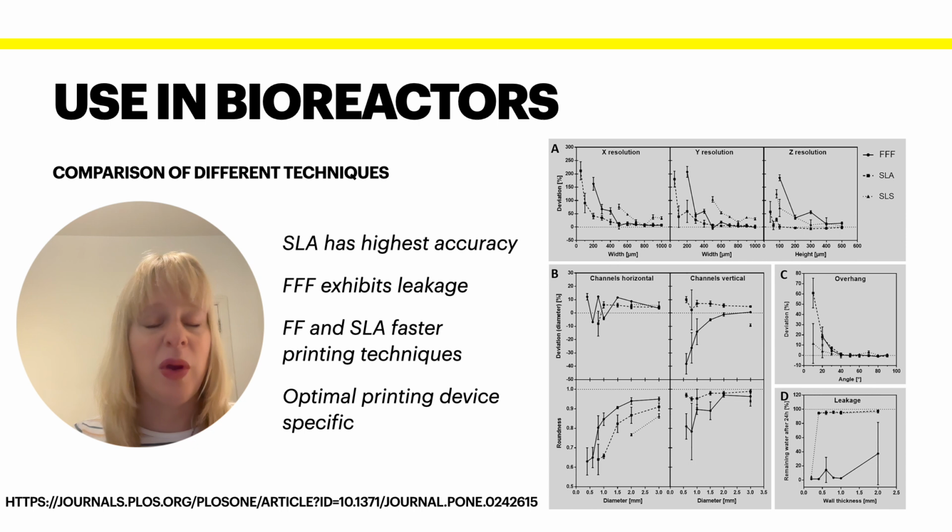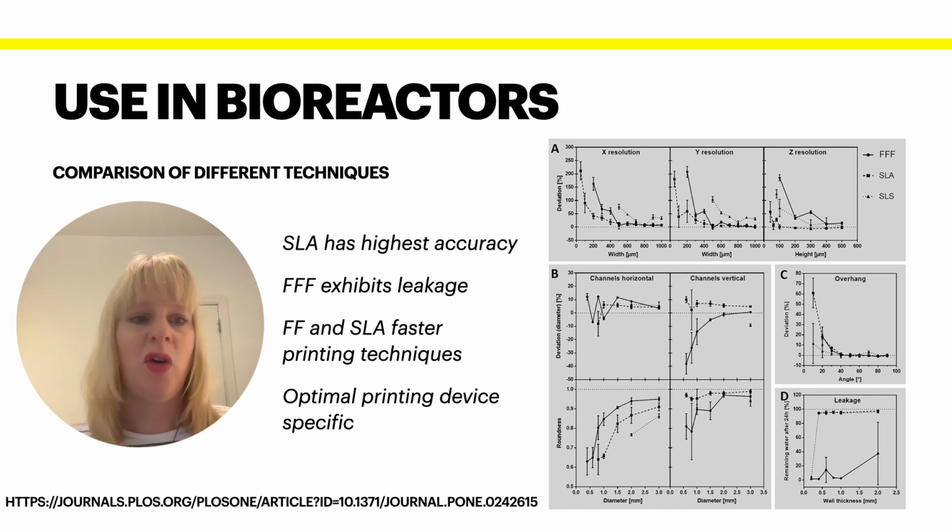And then if you need to add something else to it to optimize this, that doesn't help for the purpose. And particularly in bioreactors where you might be using higher pressures, this can be a real problem. Another thing to consider is, because these materials are porous, that you might get some absorption of specific things into your resin, which you then can't wash out.